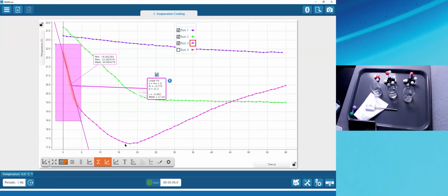Okay, so that is just one model, linear fit. Again, most of the time, almost all the analysis you're doing in the Essential Chemistry labs is you're looking at delta, you're looking at initial, you're looking at final, and you're looking at slope. That's mostly what you're going to be using. So now let's just do some more labs using those tools and getting some practice in.